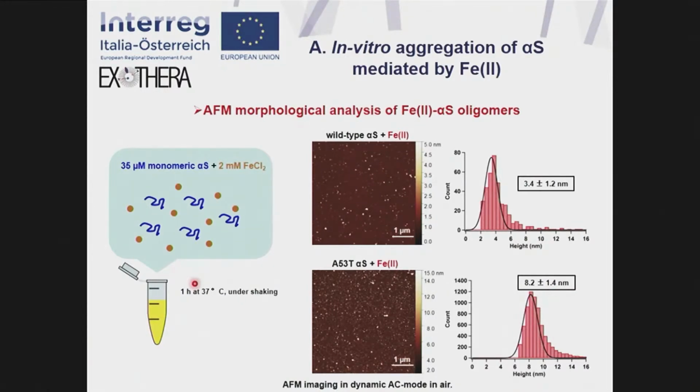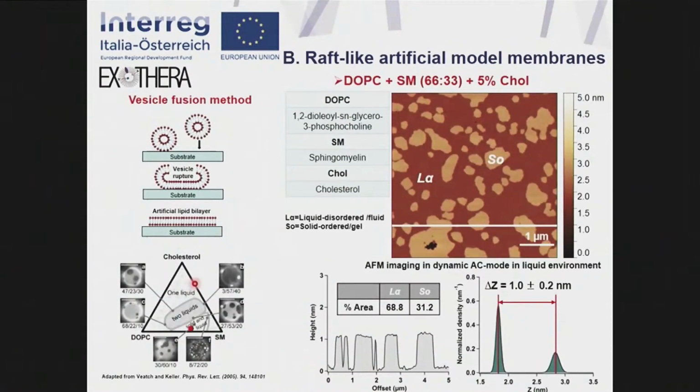After that, we moved to an investigation of the interaction with our model membranes, and so we compared the capacity of the protein to bind membranes before and after the metal treatment. We produced artificial model membranes that mimic lipid raft compositions.